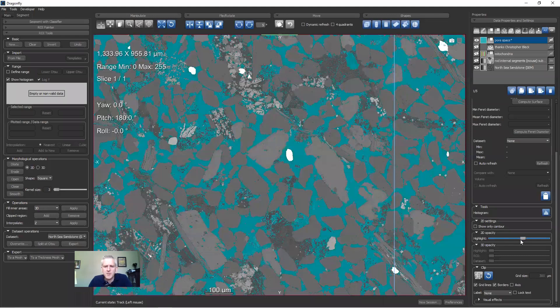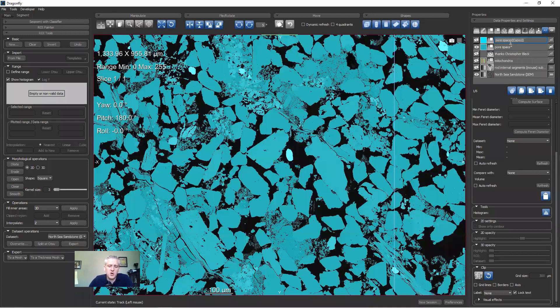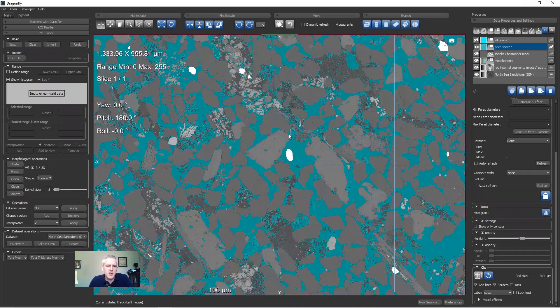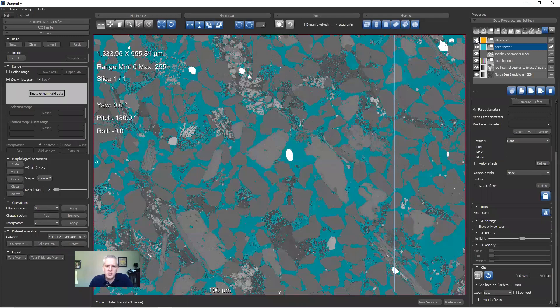Now let's look at some other features. I could click the Invert button, and now my ROI becomes all of the grains. I could make a copy of this, rename it 'all grains,' then go back to the pore space and invert it back. So we did a thresholding, made a copy, and inverted. I can give the grains copy a different color — let's try orange. Now I have grains and pore space labeled.